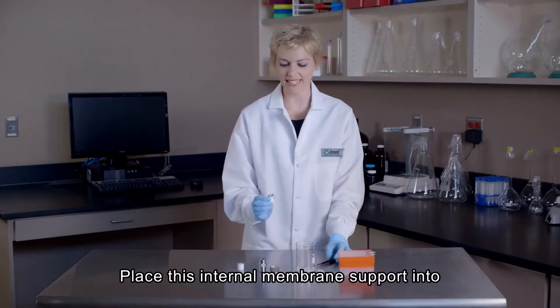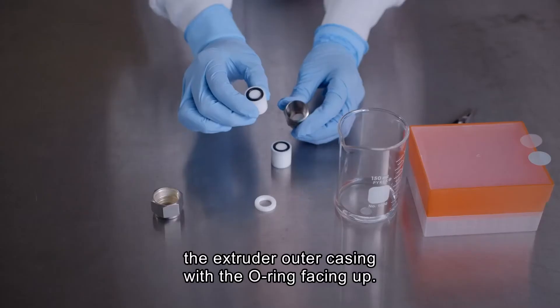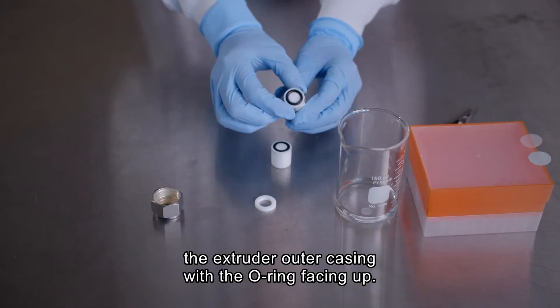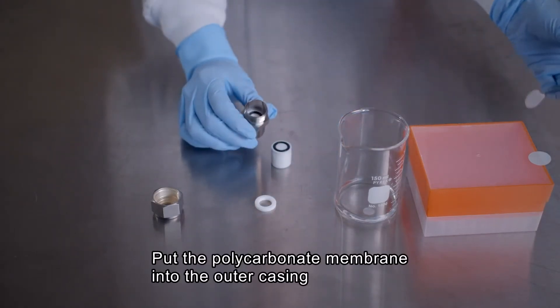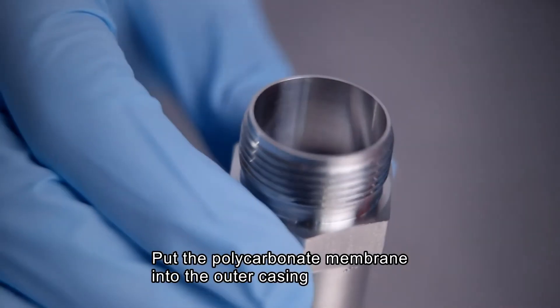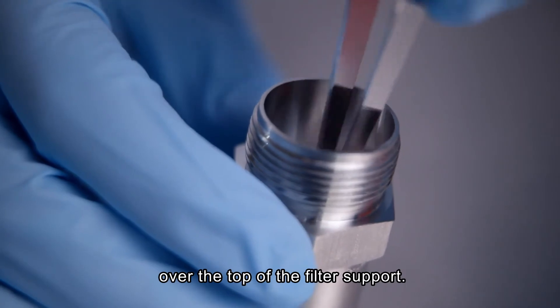Next, place the internal membrane support containing the filter support into the extruder outer casing with the O-ring facing upward. Then install the polycarbonate membrane into the extruder outer casing over the top of the filter support and the O-ring.